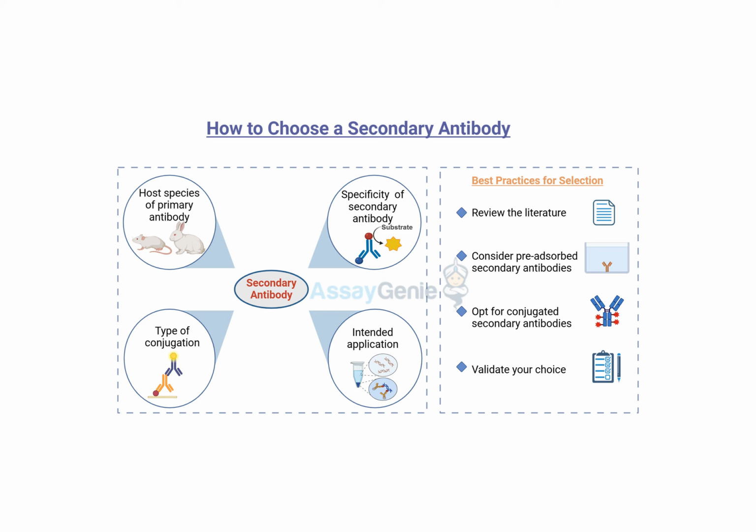So far we've talked mostly about the antibody itself, but your source also mentions how the experimental conditions themselves can impact the antibody you pick. Oh, absolutely. They specifically mentioned Western blots and IHC/IF as examples. Can you unpack that a little bit for us? Sure. Each technique has its quirks. In Western blots, for example, the size of the secondary antibody can actually affect how the protein moves through the gel. If it's too large, it can create drag. Too small, it might not bind effectively.